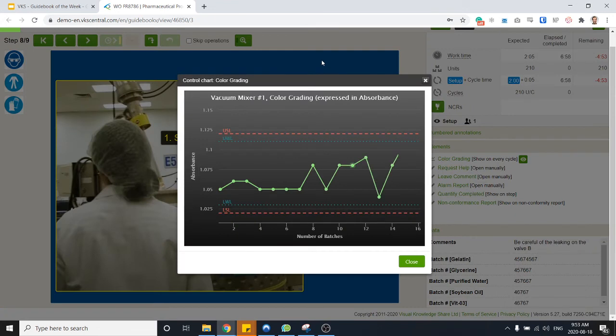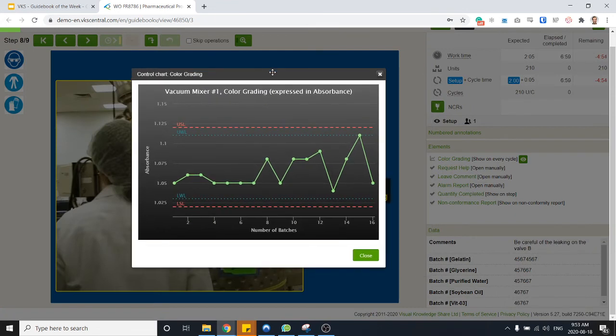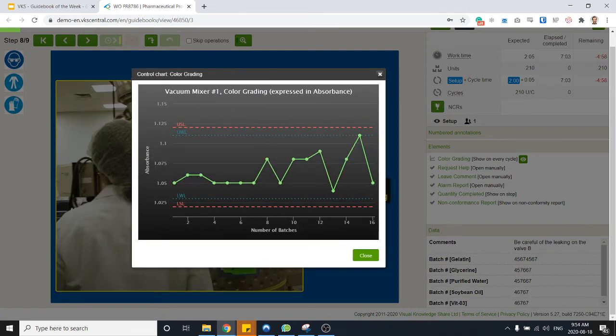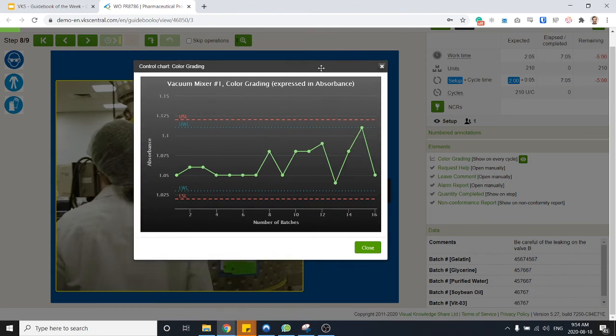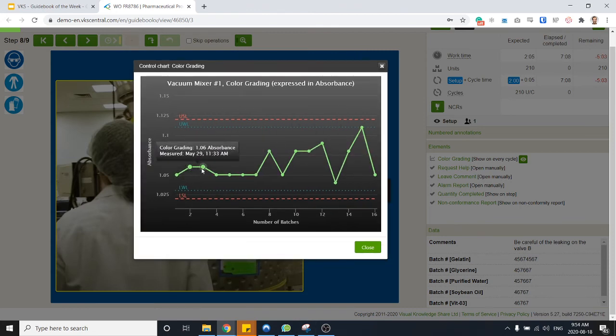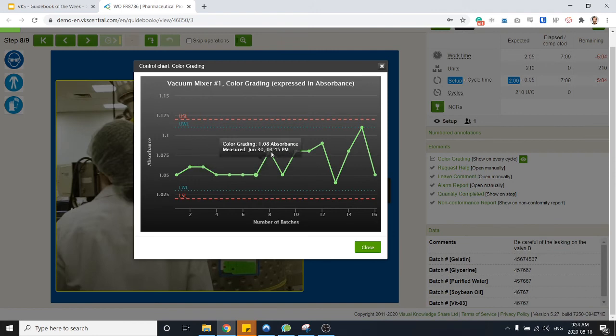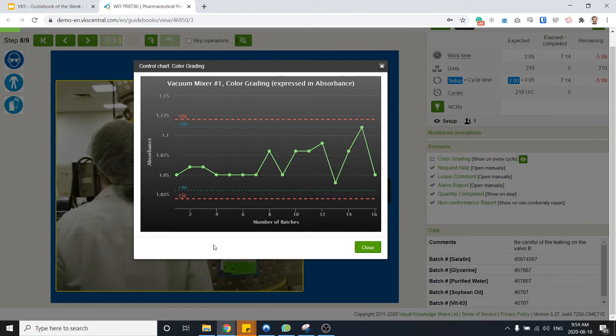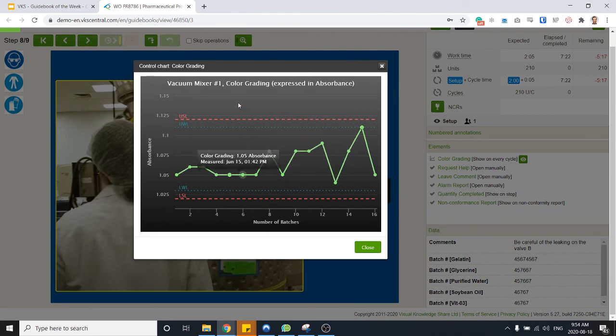But also at any point in time I can see any deviations that I had in the past. And the sampling rate of this control chart can be whatever you want. In this case it's going to ask me for that measurement for every batch that I'm running, but you can change that. You can ask for a measurement every hour, every 10 batches if you want, every day at a specific time. You can take the pH of a certain solution. Totally up to you.